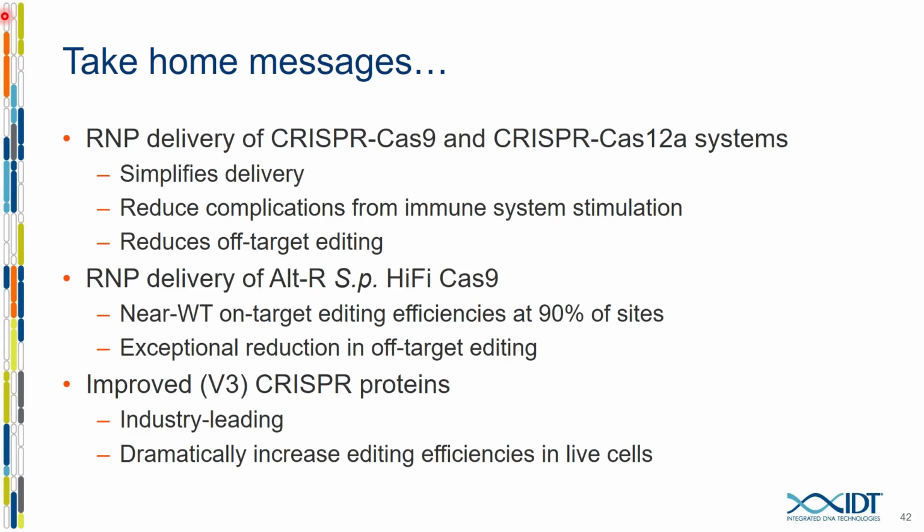Heterologous G at the beginning of the guide RNA. So I guess if you're using an in vitro transcribed sgRNA and having a non-templated G. Correct. I wouldn't recommend doing it. I think it's better to use the chemically synthesized system where you know what you're putting into cells.